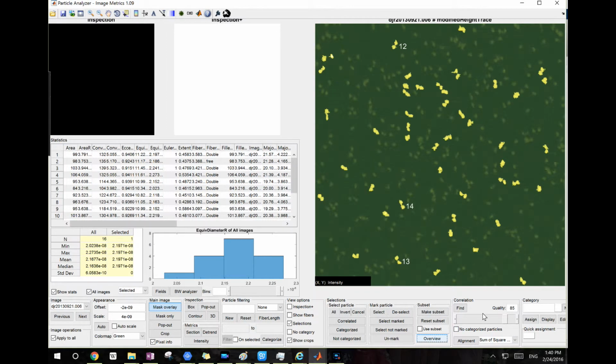So finally, you can also fine-tune your match finding. For example, I already matched up with 17, but I already excluded one. If you want to refine this process, you can adjust the slider bar. This is especially useful, and it's only used once you click the find button. It's like an undo process. So if you click find using 85 as a criterion and you want to fine-tune that parameter, using a slightly larger or smaller number for that quality but the same particle as a template, then you can use the slider bar.